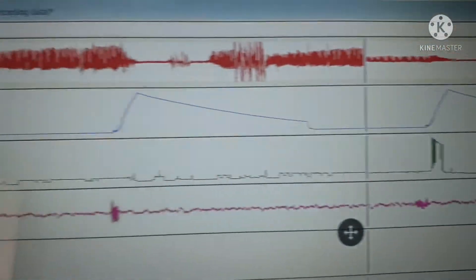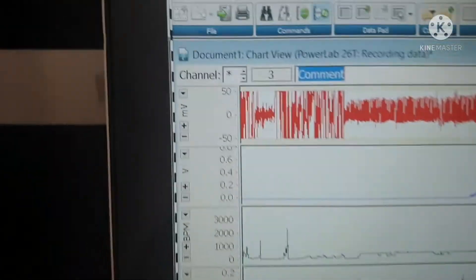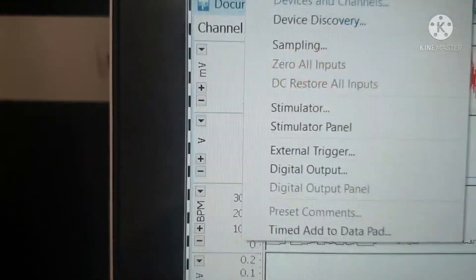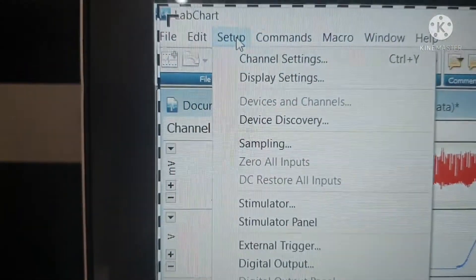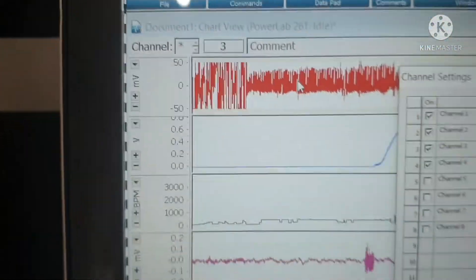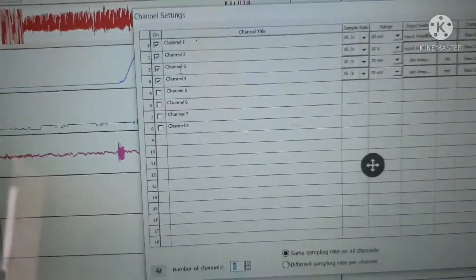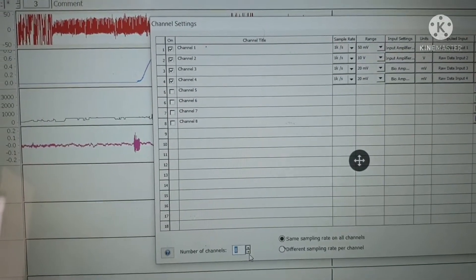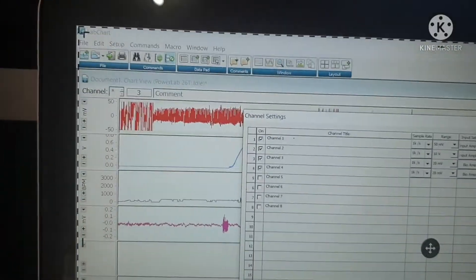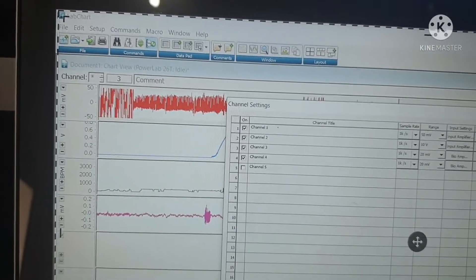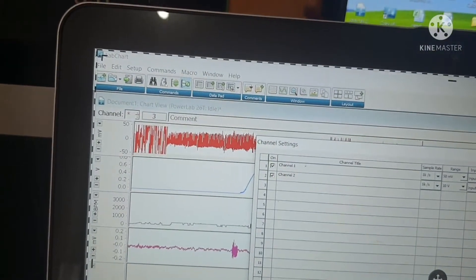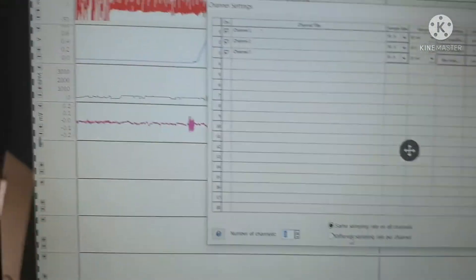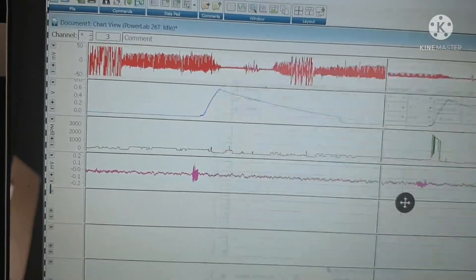Before going to calibration, let me set the PowerLab channel settings and remove unnecessary channels. Let me go to the channel settings. All channels are there, so let me decrease the number of channels. Decreasing the number of channels will help you to manage and amplify all this data. Now we remove the unnecessary channels.